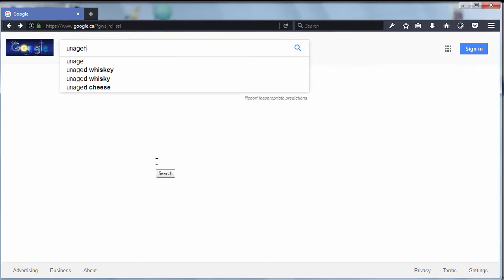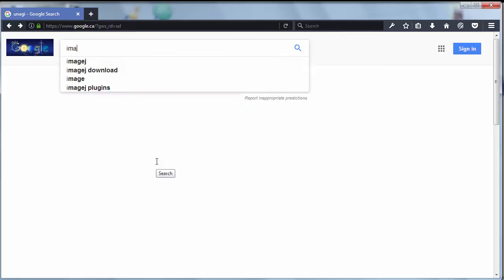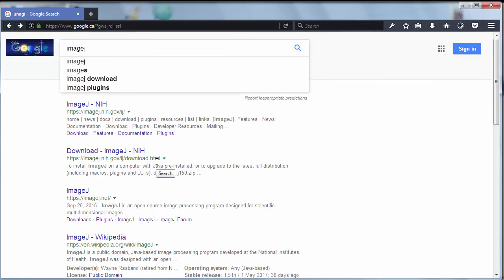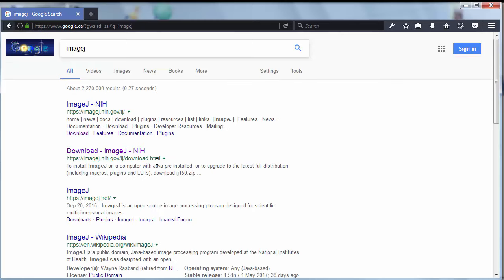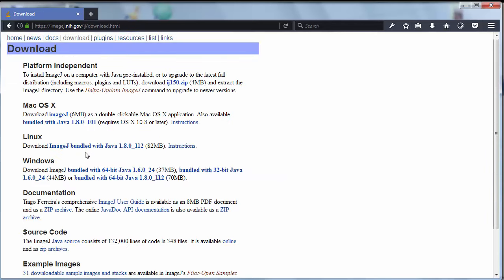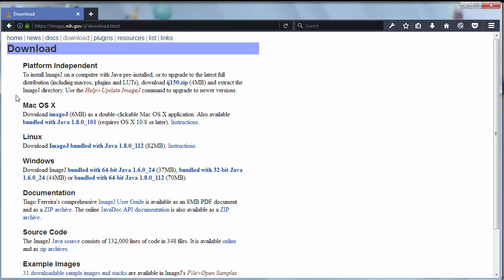First let's search for ImageJ. Let's click to this website and here we can see that this software is platform independent so you can download it for any operating system.